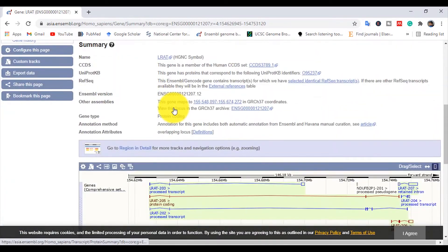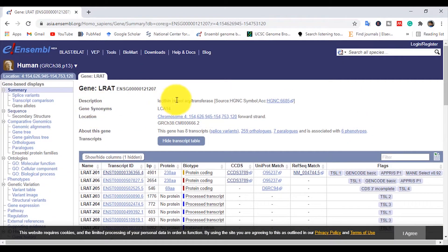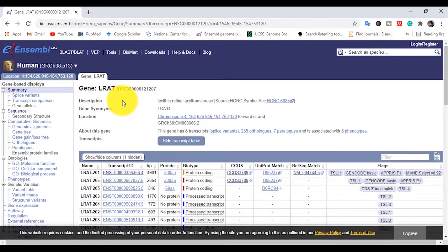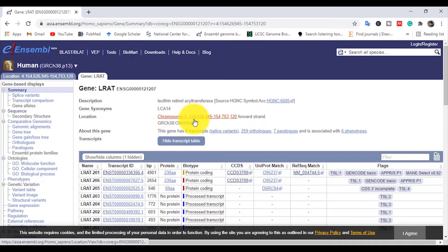The description says it is a lecithin retinol acyltransferase enzyme. This is the LRAT gene which encodes this enzyme. The gene synonym — another name for this gene — is listed here. Its location: it is located on chromosome number 4, starting from position 154,753,120. These genes are localized in the positive strand.